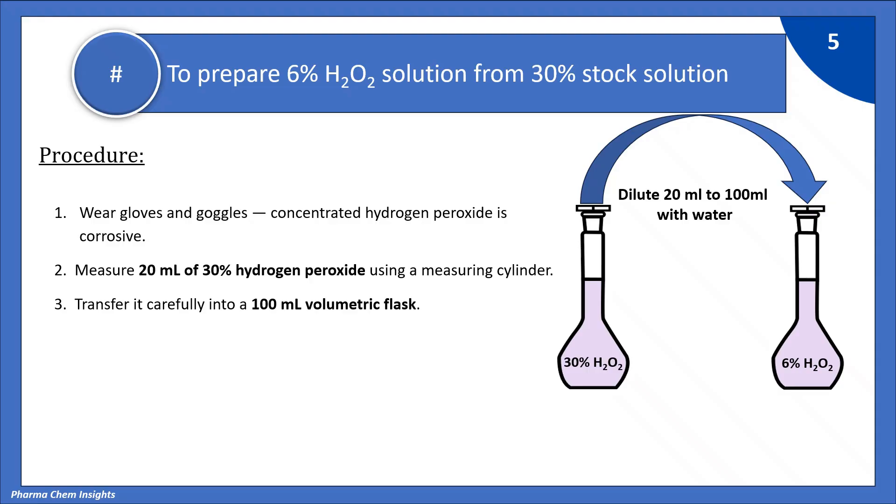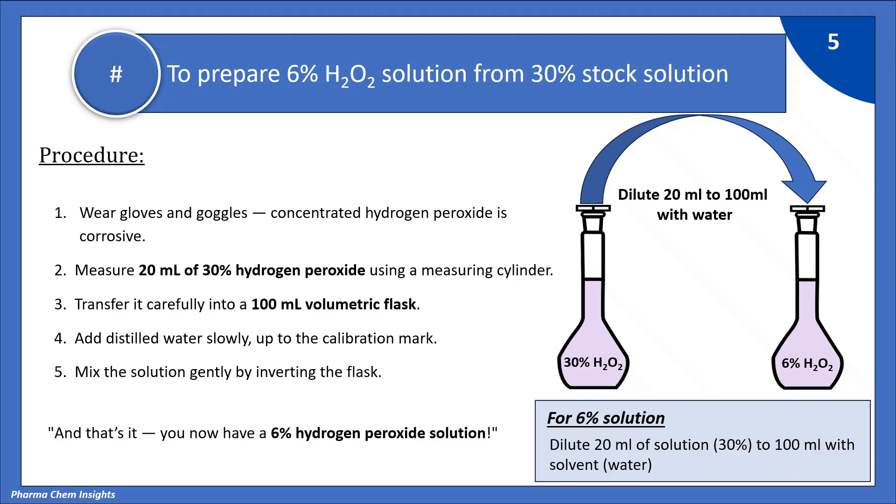Add distilled water slowly up to the calibration mark. Mix the solution gently by inverting the flask. And that's it. Now, you have a 6% hydrogen peroxide solution.